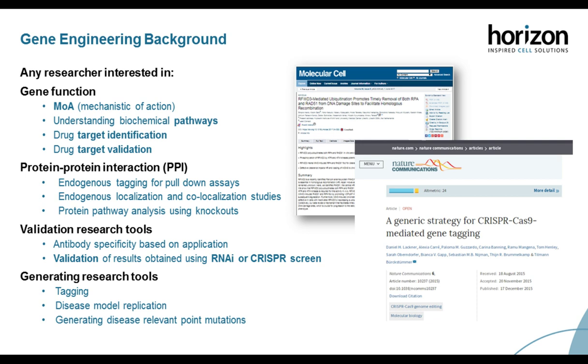Gene engineering is just around in many different functions, and it has really had an explosion lately. However, gene engineering has been around for many years, with zinc fingers, TALENs, and recombinant adeno-associated viruses. But there has been this explosion in gene engineering with the adaptation of CRISPR technology. CRISPR has really made gene engineering less costly and less time consuming. So there really is no longer an excuse to work with a bad model. And that's why we've seen this explosion of gene engineering research.